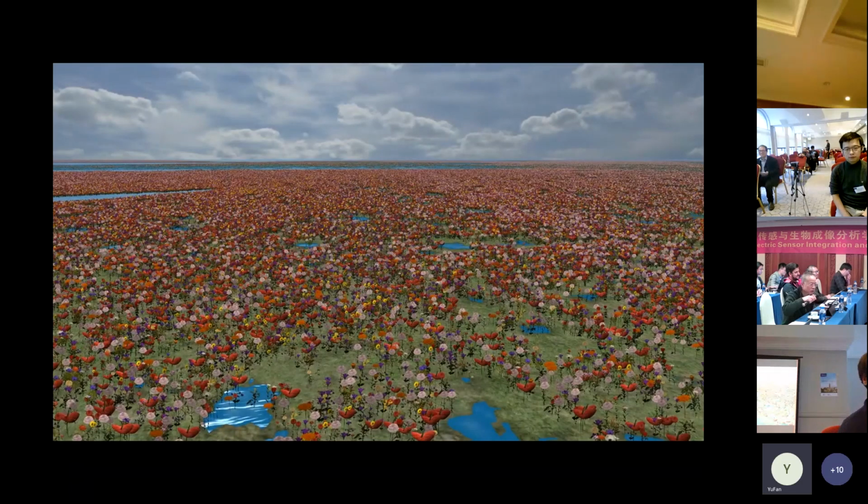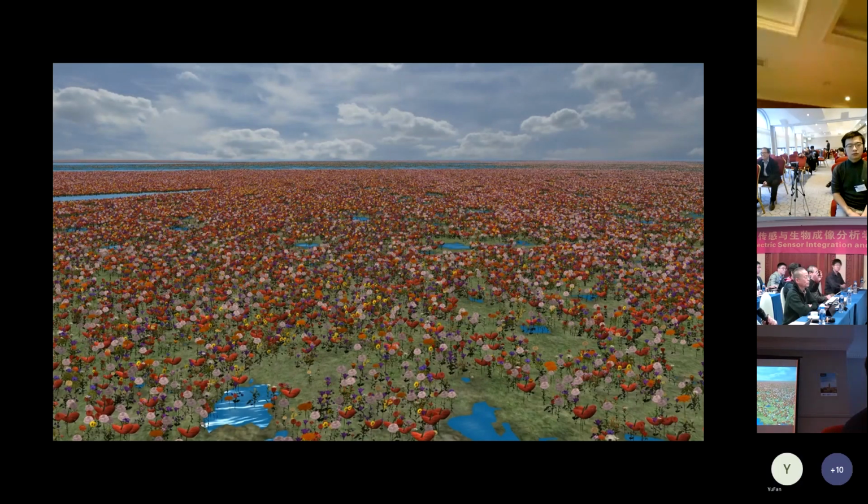What you see here is the real mouse brain with a color mapping applied for the land. The sky is just an image that I took, and the 3D models were kindly donated by a company that makes 3D models, and I just replaced each different punctum type with a different model. Does the color represent the intensity of the protein? Yes.